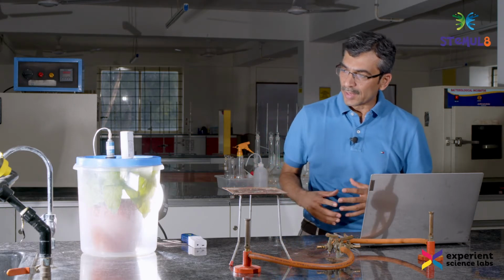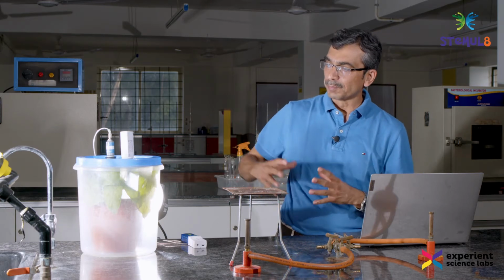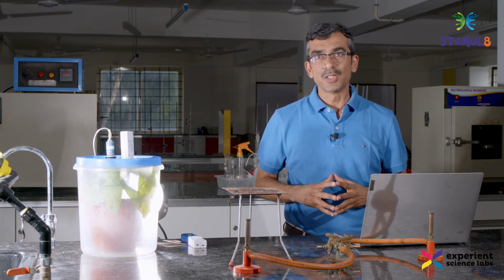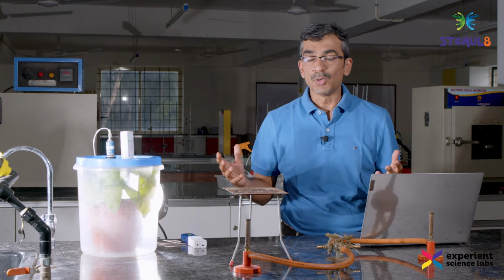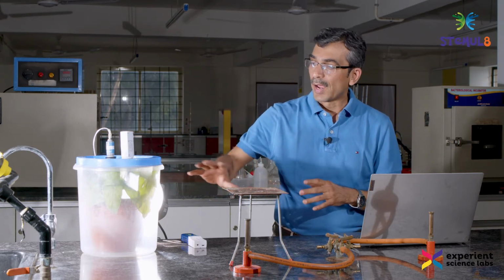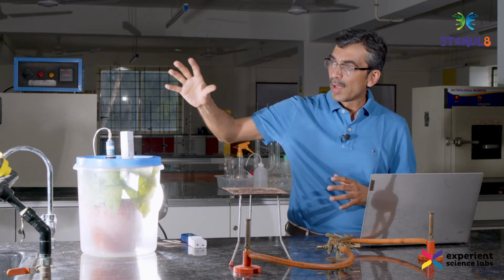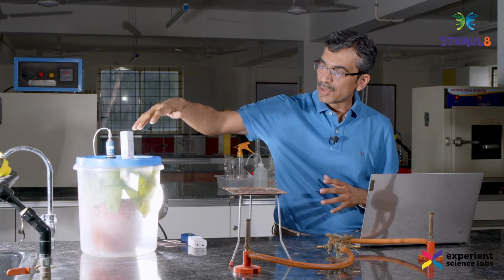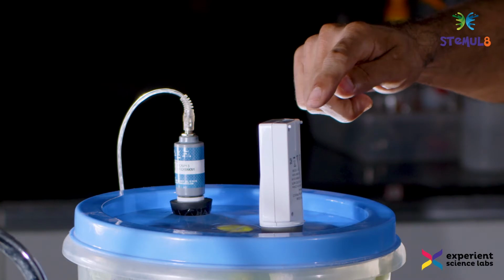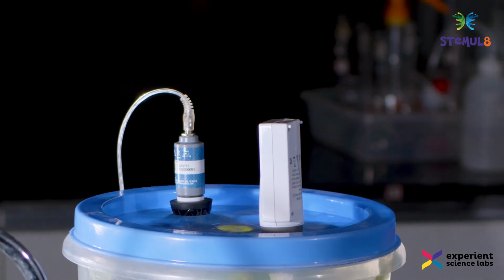What we have here is a plant with big leaves, and we wanted to put that in the sunlight and see how the photosynthesis goes on with that, but we are not able to do that. So we have now put this into the box, or jar, whatever you want to call that. And on top of the lid we have put two sensors: one is the carbon dioxide sensor and one is the oxygen sensor.